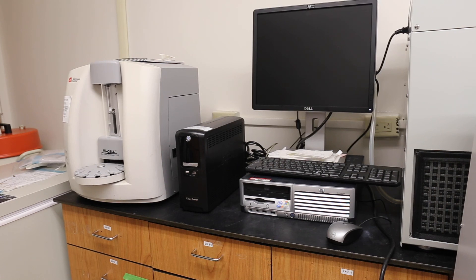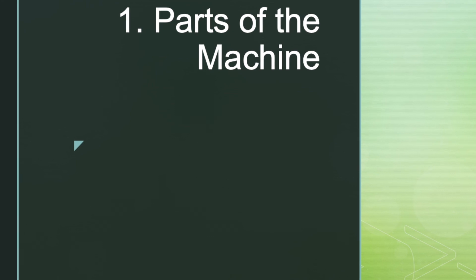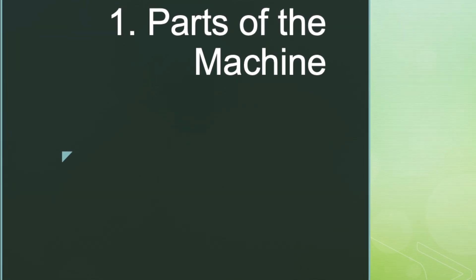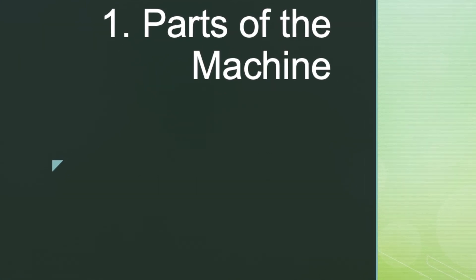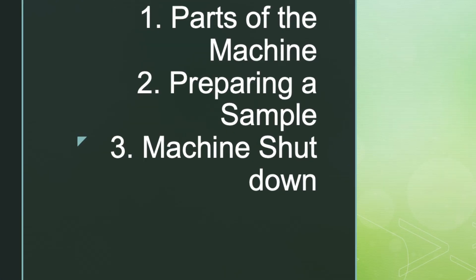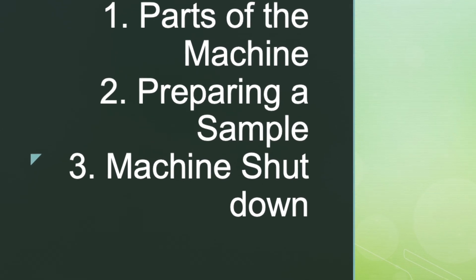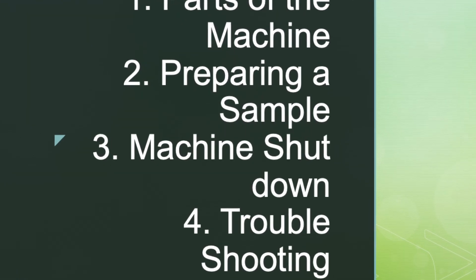Hi everybody and welcome to the lab. Today we are going to go over how to use and operate the VICell cell viability analyzer. We're going to first talk about some of the different anatomy and parts of the machine and what they do, how to prepare and run a sample for trials, how to shut it down properly, and some troubleshooting errors.